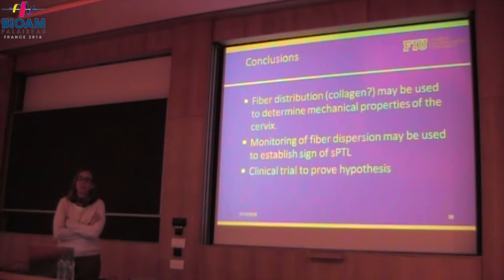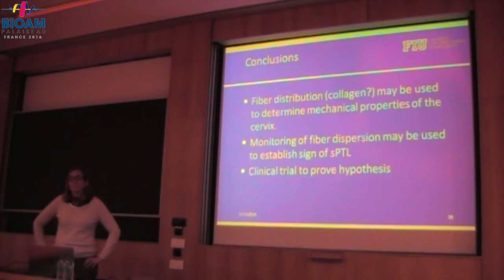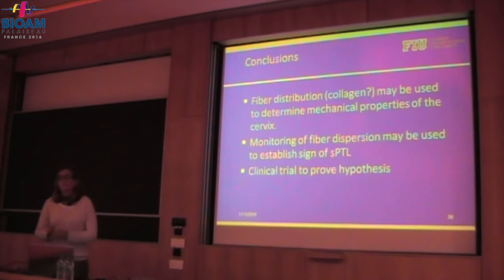But I'm just confused a bit. When you apply the pressure, that makes additional stress for the collagen fibers. My understanding is that if you do that, the birefringence properties of collagen fibers are changed as well. And thus, when you apply this Lu-Chipman algorithm, if the properties are changed layer by layer with no a priori knowledge of how they changed, how effective is it to be used in general for quantitative assessment of changes within the tissue?